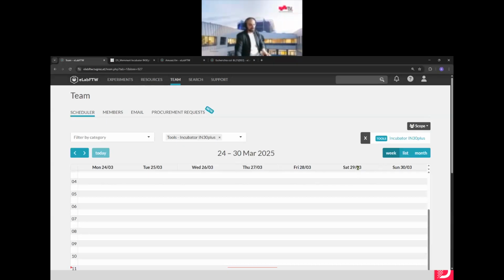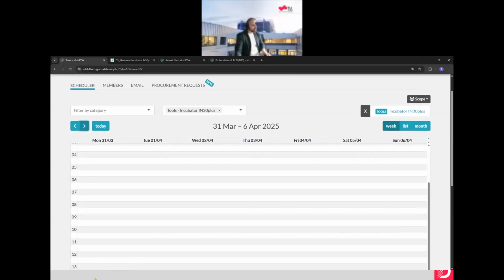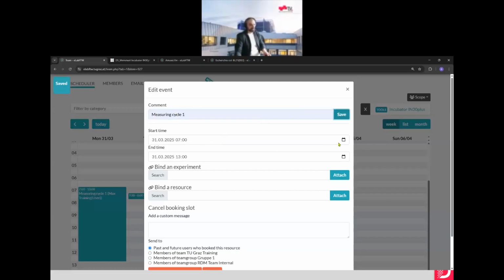And because I said I will start on Friday, I guess I will need it next week. So I want to book it from maybe a little longer, say measurement cycle 1, save.